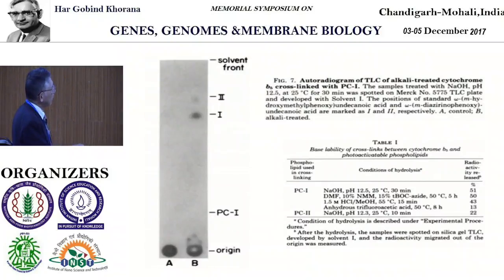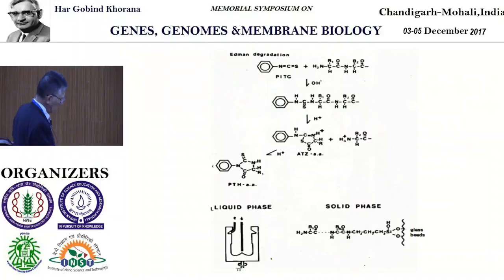And these labile products cannot be analyzed by Edman degradation or stepwise sequencing, because stepwise sequencing requires an acid phase and an alkali phase. So by stripping off unstable groups and then applying them to the sequencer, but a liquid phase sequencer couldn't retain the cross-linked peptides.